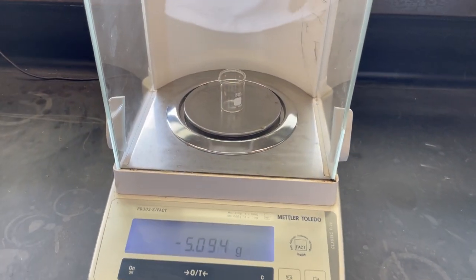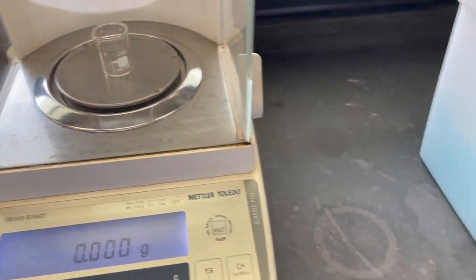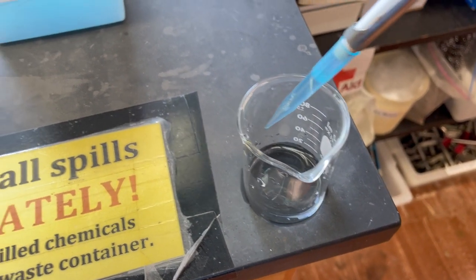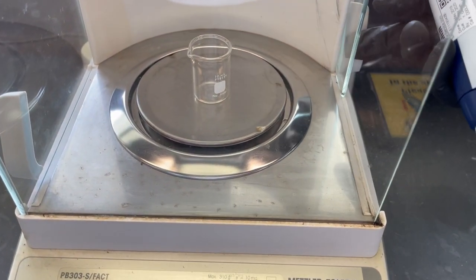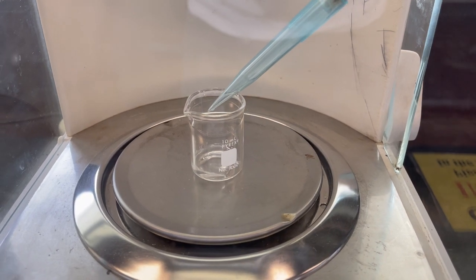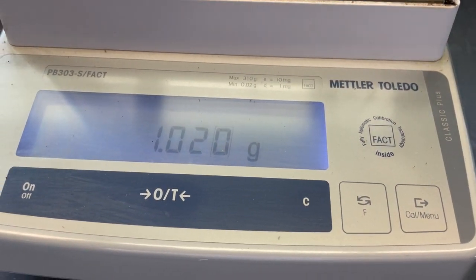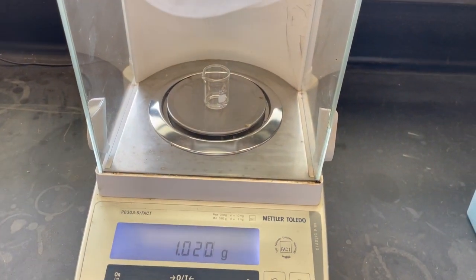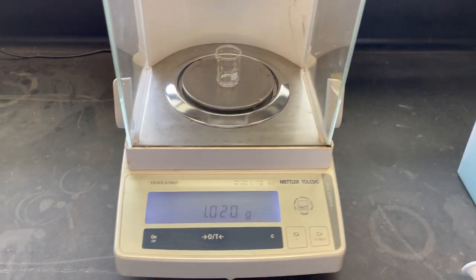Okay, so I put a beaker in there. I'm gonna go ahead and tare that. And now what I want to do is grab some water. Go ahead and open this up. I'm gonna measure what should be 1 milliliter of water, right? What's the mass of 1 milliliter of water? Oh, 1.02, good enough for me. I just wanted to make sure that this micropipette was actually a good one and measuring about 1 milliliter. I'm sorry, 1 gram per 1 milliliter of water. So now we can use it to determine the density of our fractions, and then from there we can actually calculate using a chart the percent composition of ethanol.